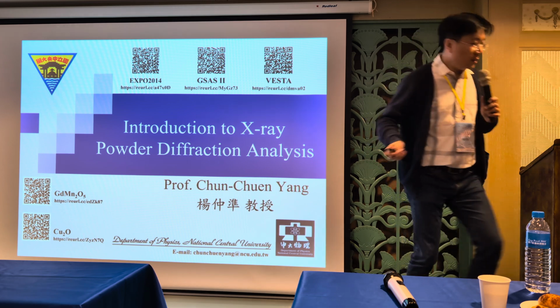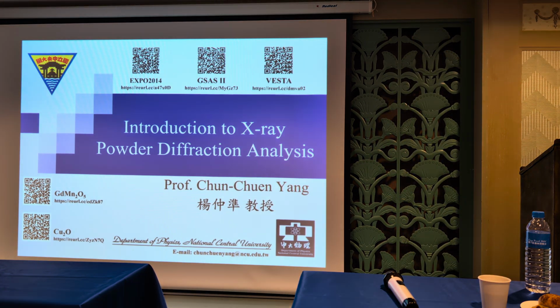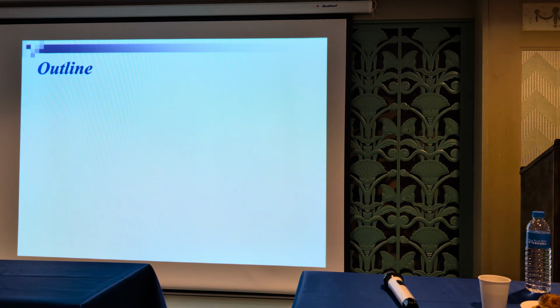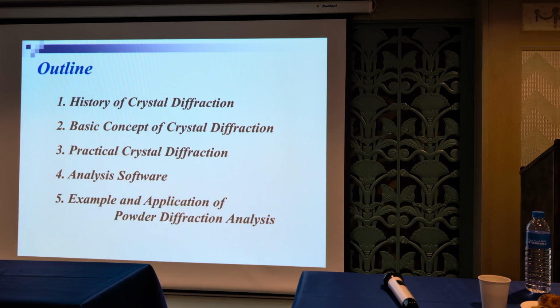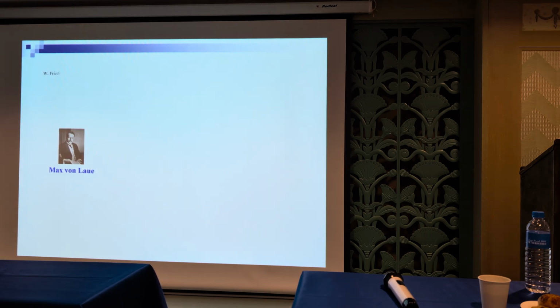Okay, I will ignore the history of crystal diffraction, but I want to give you a basic concept of crystal diffraction. Then I will show you how to do the diffraction experiment, and then we will talk about the analysis software.